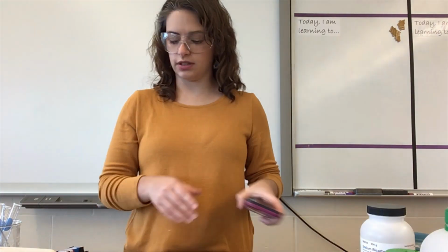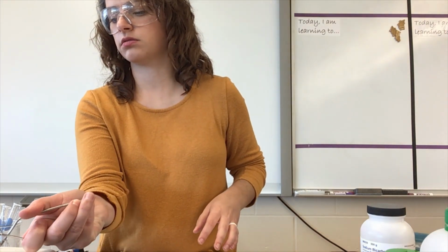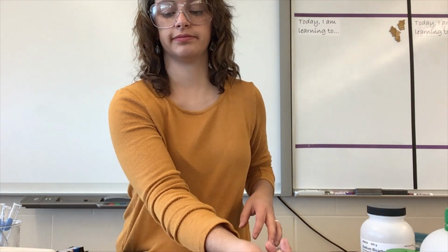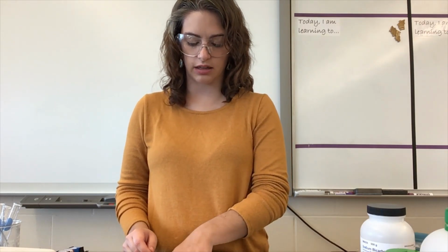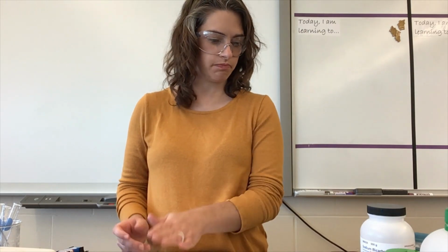And this one definitely melts. So it has a low melting point. This one actually doesn't smell bad. It smells kind of like marshmallows. Okay, so sucrose, we have the appearance. It was soluble in water, not conductive in solid, not conductive in solution, and has a low melting point.